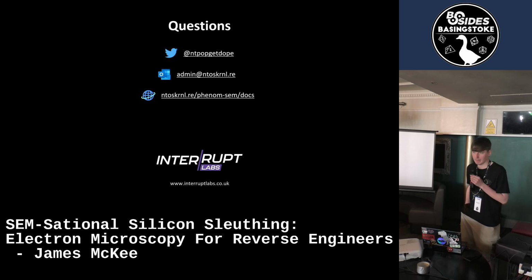You mentioned detectors passing at various points. Yes, I work with part of my detectors. You're getting close to 6 figures for new ones. Is there a similar sort of market for second-hand ones?